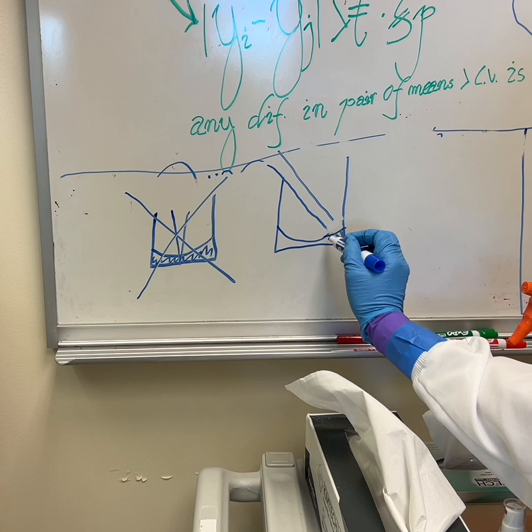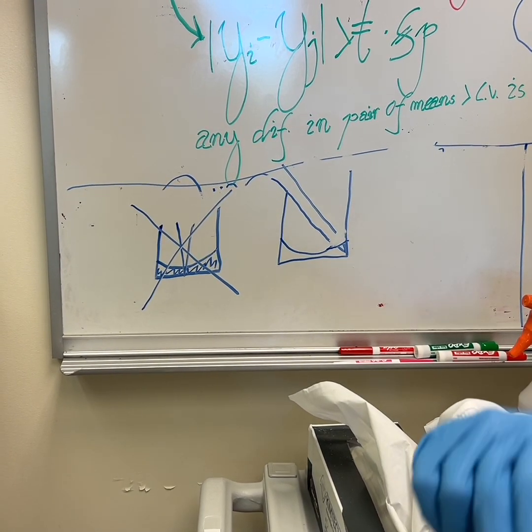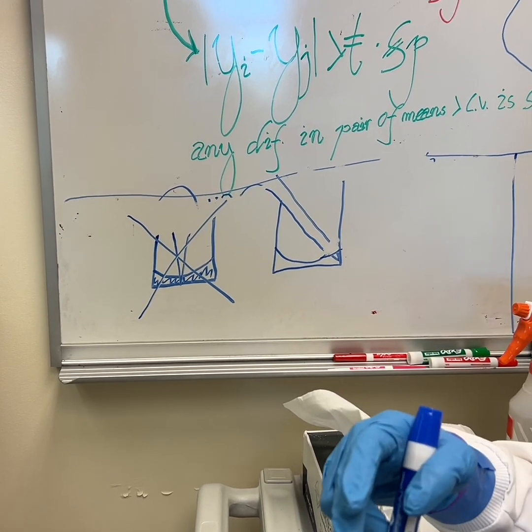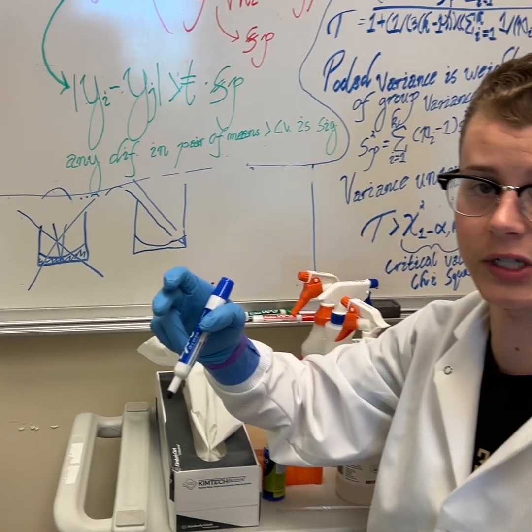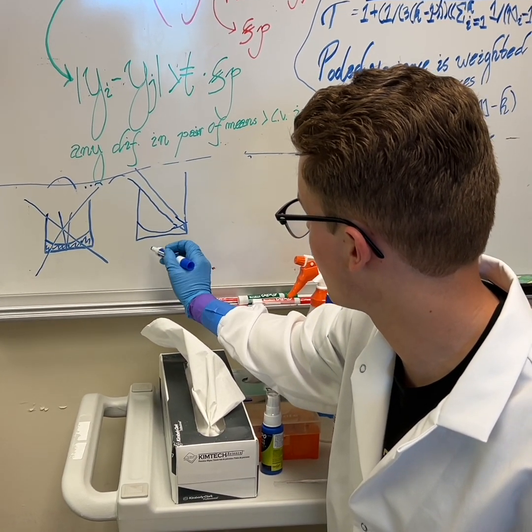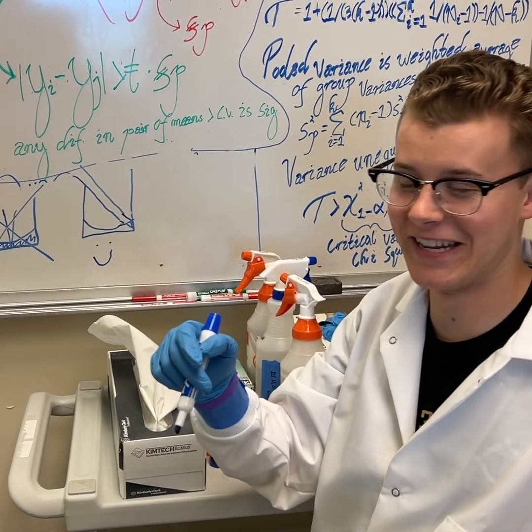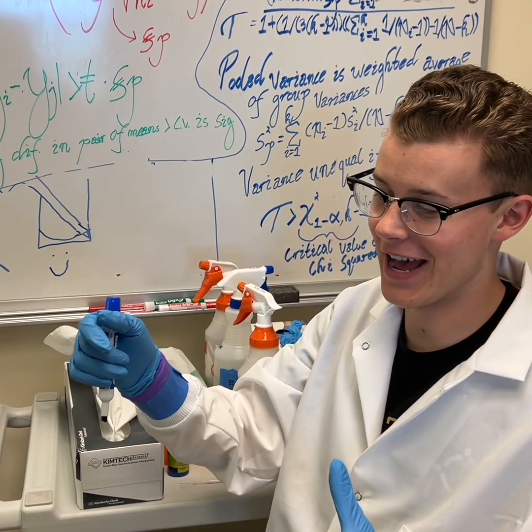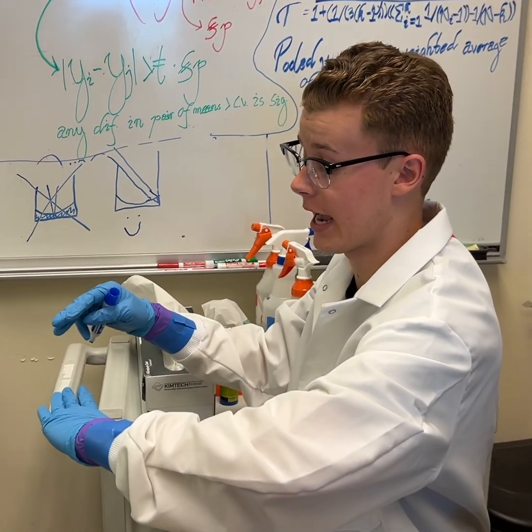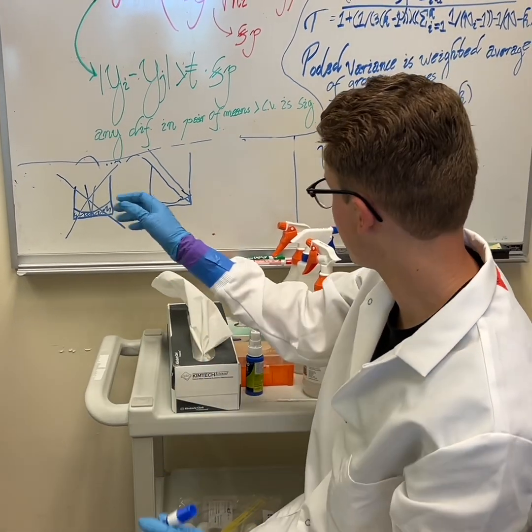So that'll disturb much less of the biofilm, and it'll help you place it at the exact same spot in every single well, so that you have a constant across all wells where you're touching them, and you're not scraping either. You're just setting it in that corner, and that's what we want. It's hard when you have the plate flat on the table of the biosafety cabinet.